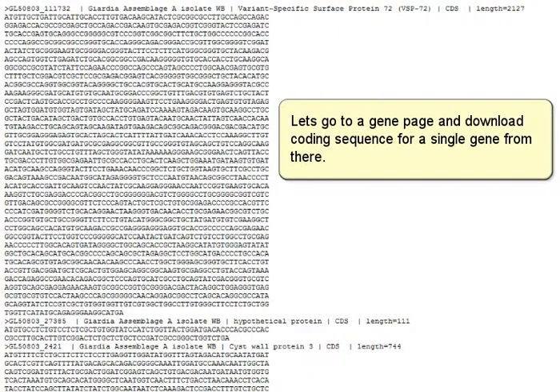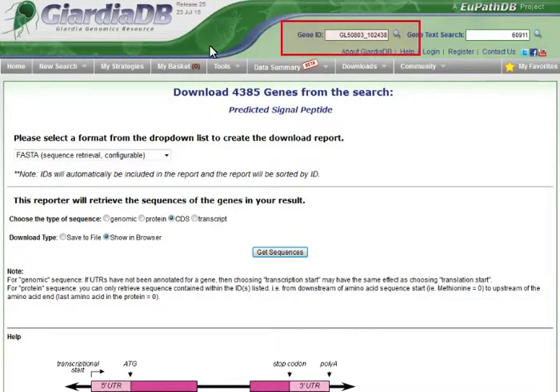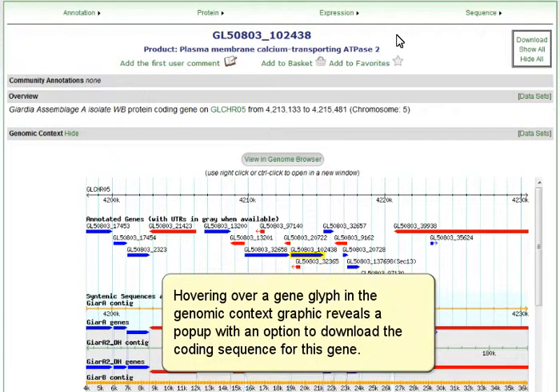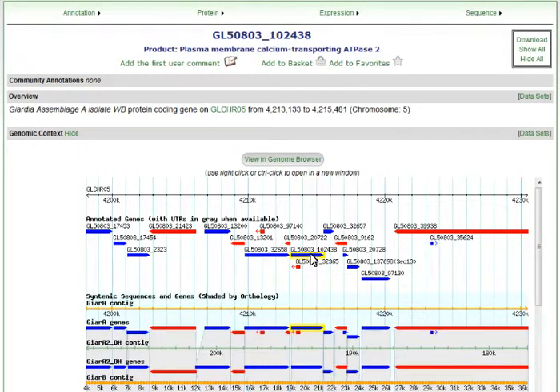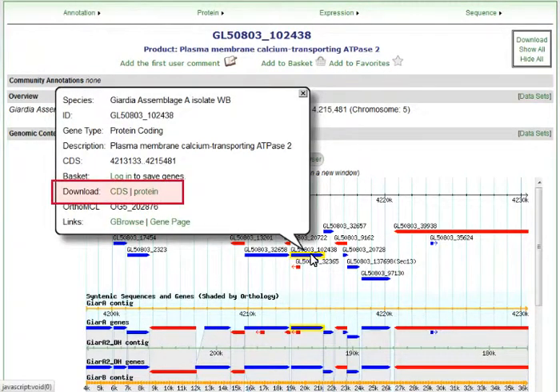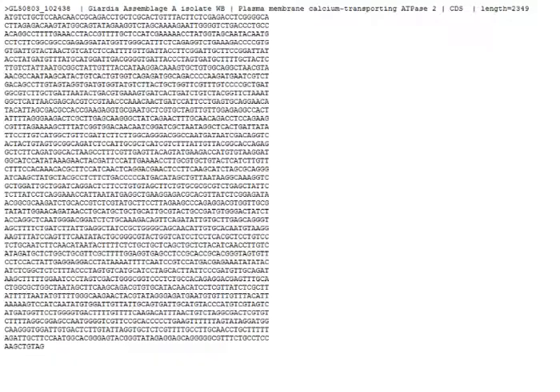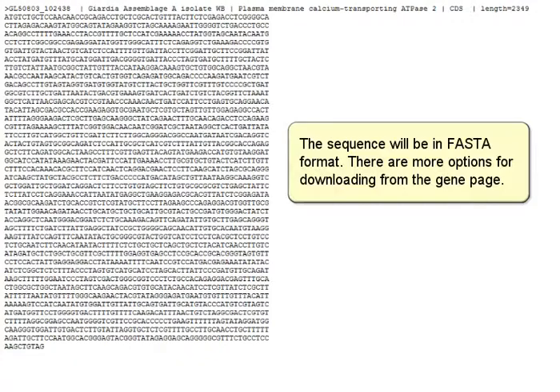Let's go to a gene page and download coding sequence for a single gene from there. Hovering over a gene glyph in the Genomic Context graphic reveals a pop-up with an option to download the coding sequence for this gene. The sequence will be in FASTA format.